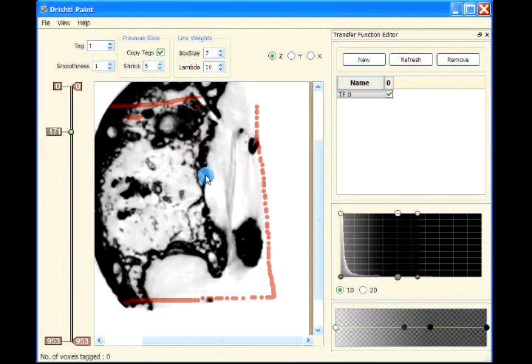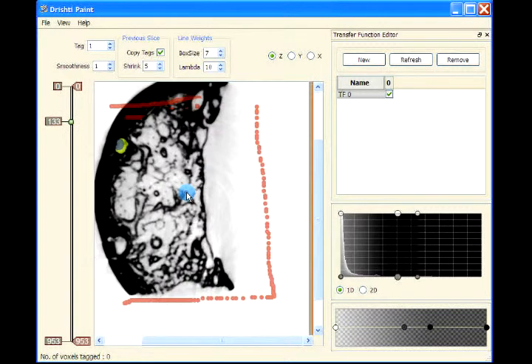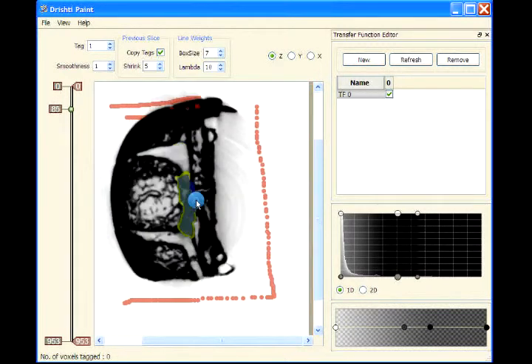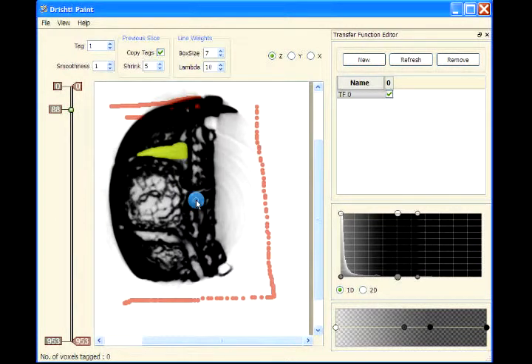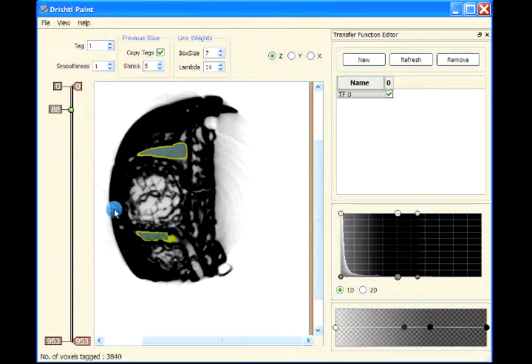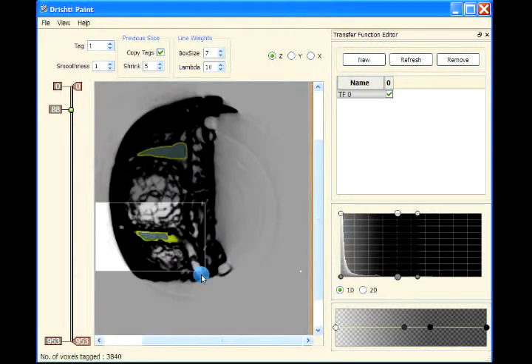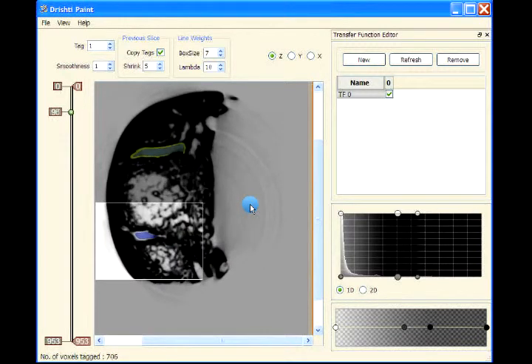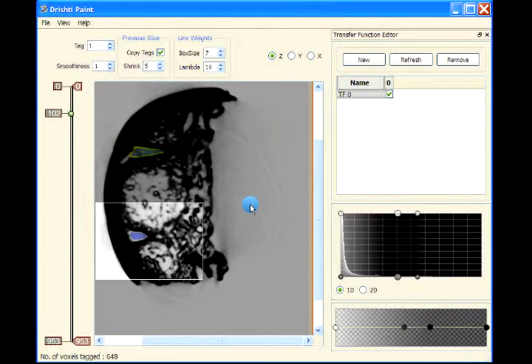double click, let's go back and let's start the process for this channel here. So this is the other channel. Press tag, okay, press escape, and then again we are going to just limit the process so that it goes faster.